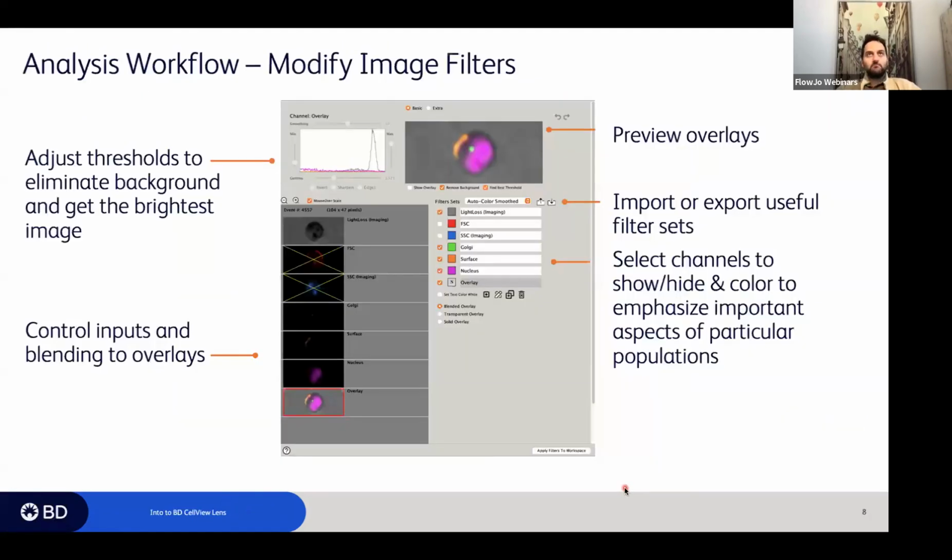Okay, so of course, what I would do first when I drag and drop my samples would be setting up the image filters. Every microscopy experiment, as you would know if you're already performing them, has setting those up as its alpha and omega.